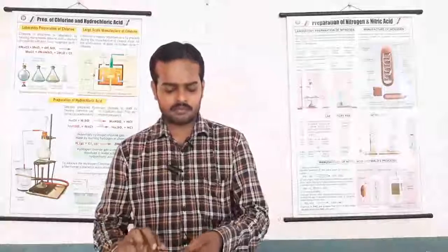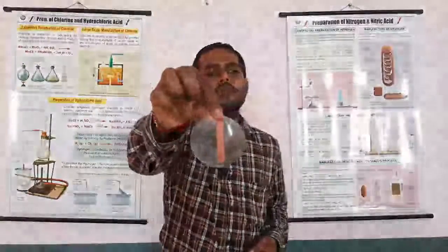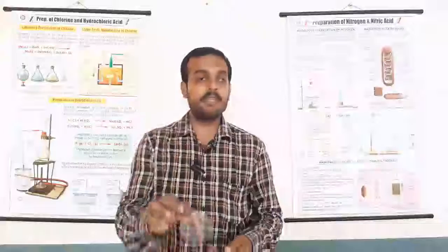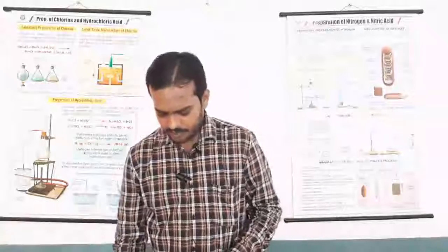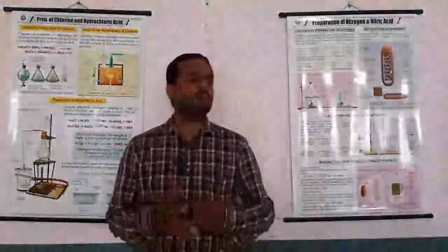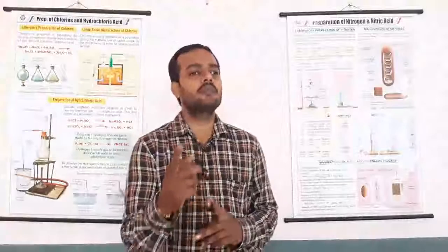See what happens. When blue litmus reacts with sample A, it turns red. It means that sample A is an acidic sample. We can reuse the used litmus paper. You will ask how? As you know, a base turns red litmus blue.